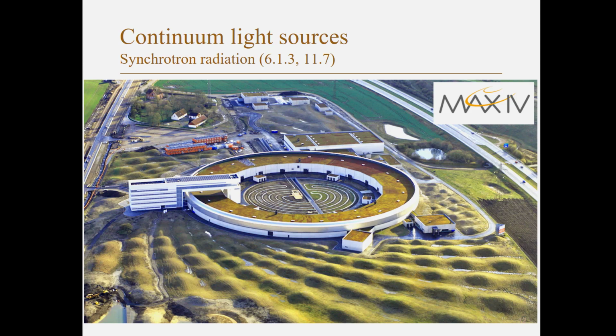So the next light source I'm going to talk about is synchrotron radiation. As many of you are probably aware, in recent years a big new synchrotron facility has been constructed here in Lund, namely MAX 4. The special thing about synchrotrons is that they can have radiation with much higher energy than you get from the other sources we have talked about so far. Synchrotrons can go all the way from visible, but there are many sources in the visible, so the primary interest is that it can go all the way to X-ray energies.